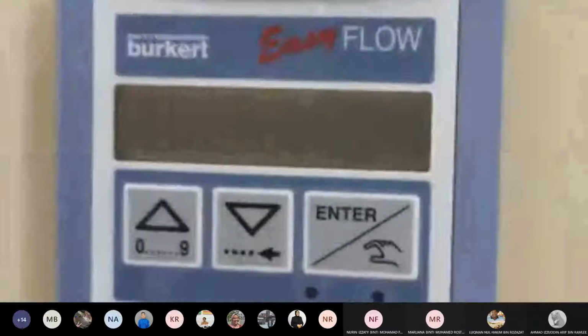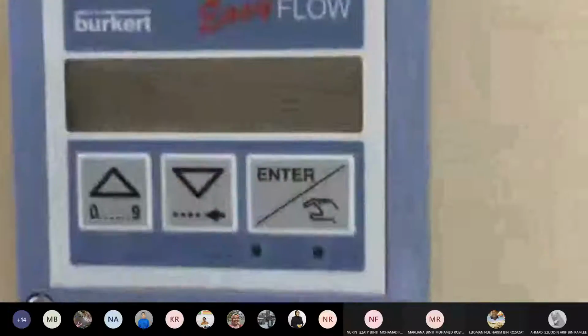Maybe you will ask, Doctor, how do we control the flow rate? We control the flow rate using this one. You see there are V5 and V10. V5 is connected to 301, sorry, V10 is connected to 302. So we control the flow rate here; we will switch on or switch off. When I control here, I am supposed to read at 301. So I control V10. If I want to increase or decrease, I read at 302.